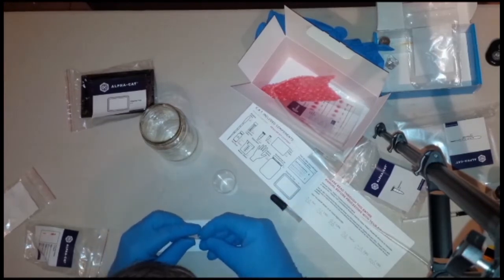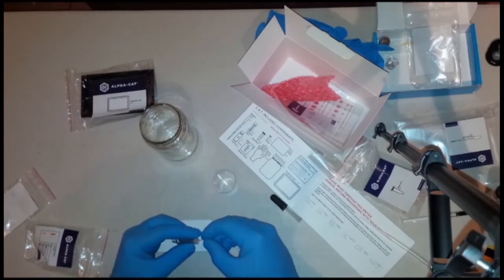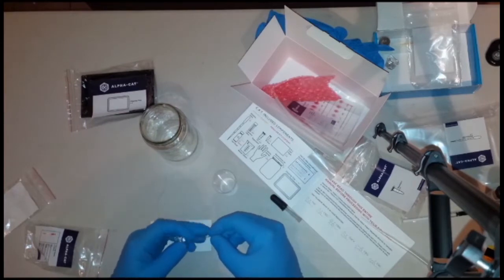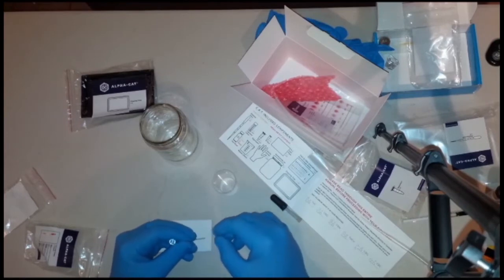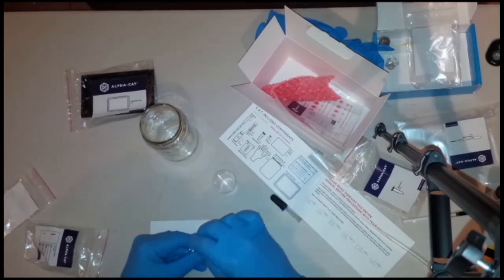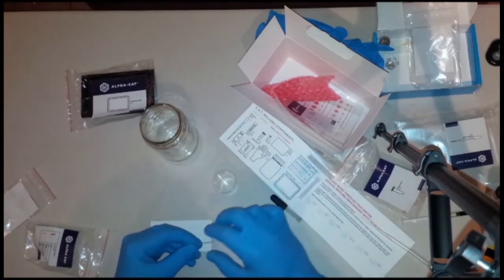Make sure you really take your time when using the capillary tubes. They are quite delicate and probably the most temperamental part of the whole process, although not difficult. Just take your time and look closely at the capillary. With our RSO solution being very dark, if you look closely at the glass tube, it will be very clear to see the capillary is full to the top, which is what you want. Then you know exactly one microliter is going to be used for each spot on the test plate.